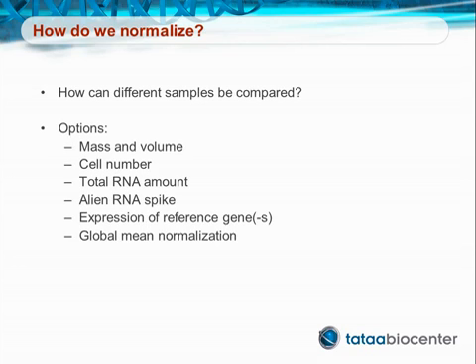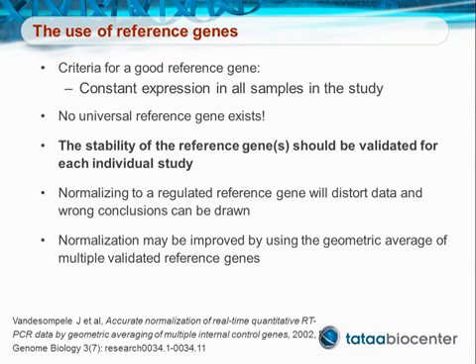Even though normalization is often performed at different levels, the most common in gene expression analysis is to use one or preferably more than one reference gene. So what do we mean by a reference gene? Well, it's a gene that is constantly expressed in all samples in the study performed.